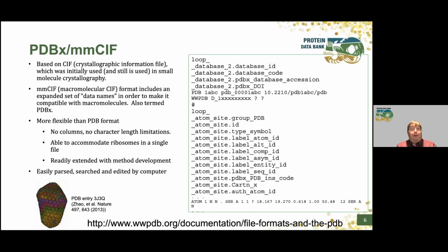We could also readily expand this with method development. In the last few years, serial crystallography has become much more popular, and we are now collecting new metadata for that. That could not be incorporated into the legacy PDB file format because now that would be breaking the format that everyone is relying upon, the fixed standard. But with mmCIF, we could easily add these data items in a unique way, and people who are interested in them could then mine them.